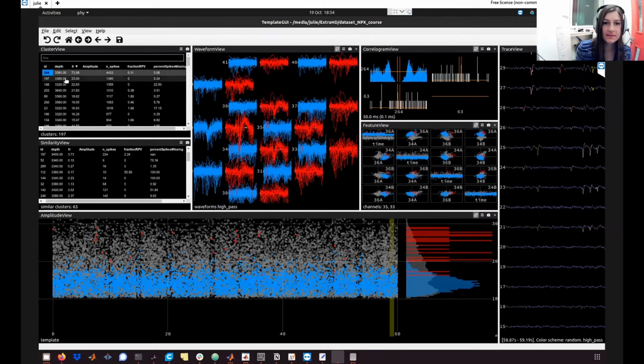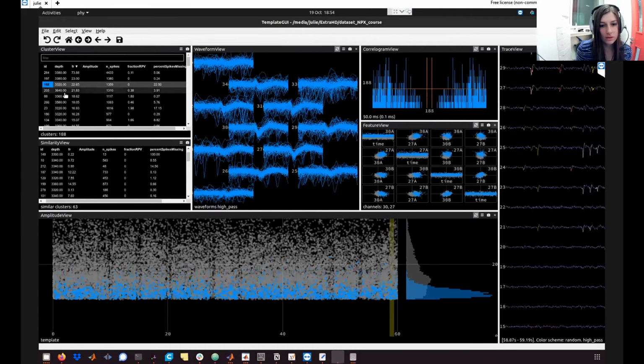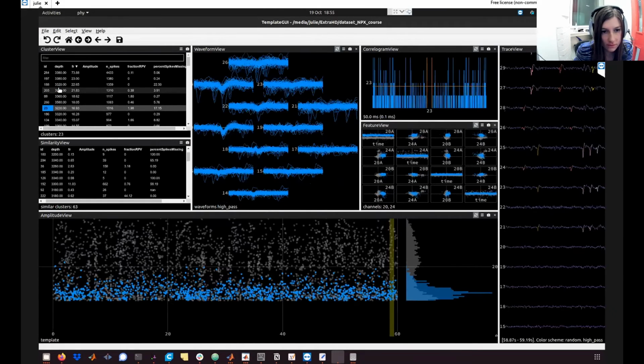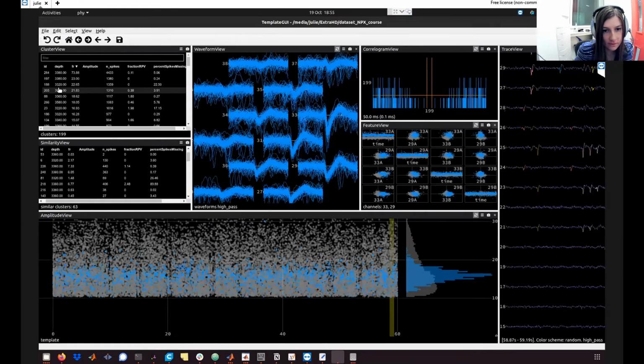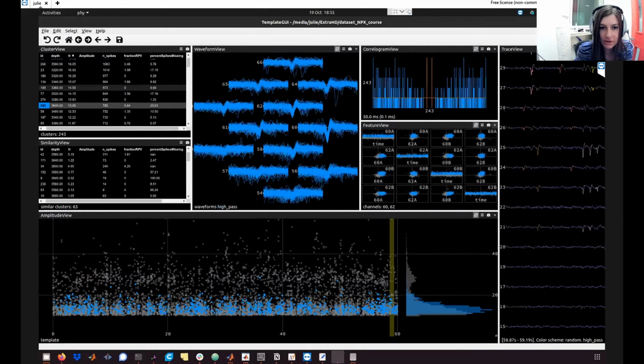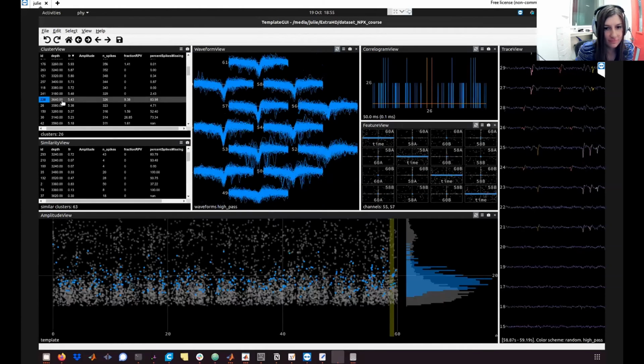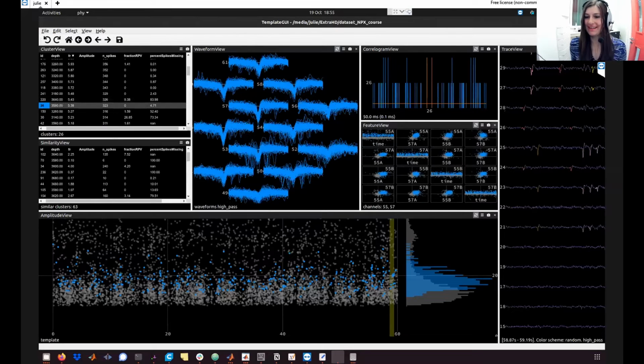Okay, if I look at just the next few units. This is an example of a unit where a lot of the spikes have not been detected. It's probably a unit that's further away from the probe, and this we would probably classify as multi-unit activity. And finally, I'll see if I can find an example of noise. Maybe not. Well, maybe I'll just leave it at that.